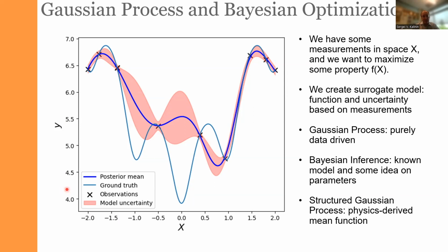Notice one very important thing: in most cases, we encounter experimental scenarios where x is actually not a scalar. For example, an aberration corrector has much more than one control. We can explore phase diagrams which have more than one component. Then x becomes a vector. Interestingly, in some problems, x can have a fairly complex nature.